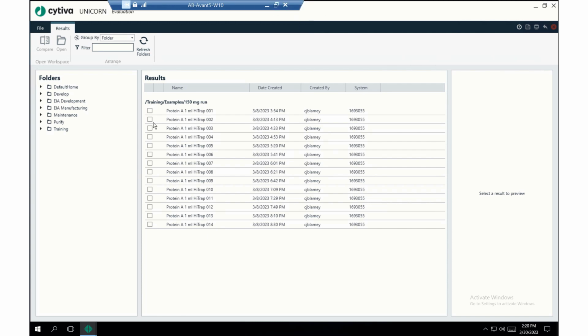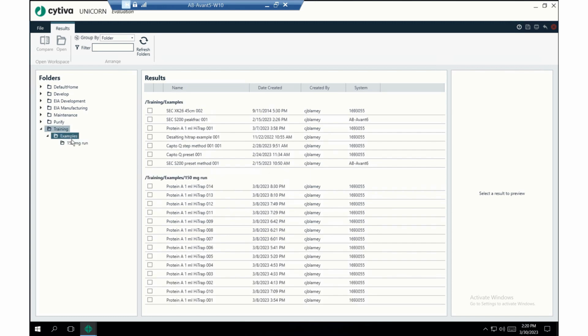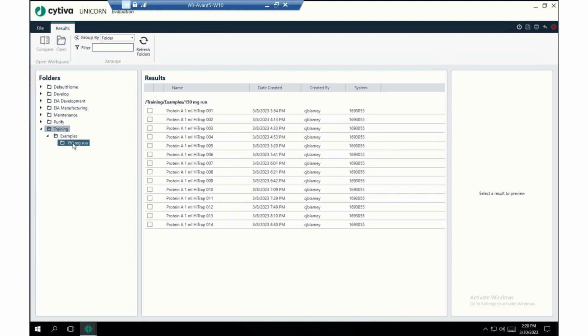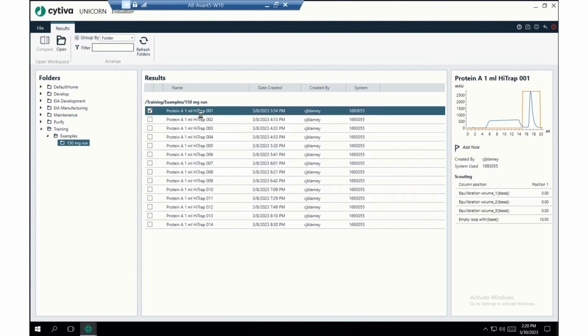First, we can see that all the files are right here. That's just because we ran it. But how you find this scouting subfolder is you open up the training folder, and then it would be in examples, and then there's going to be another folder in there called 150 milligram run. So we'll open that up, and this is where the results are. So let's just take a look at the first run.